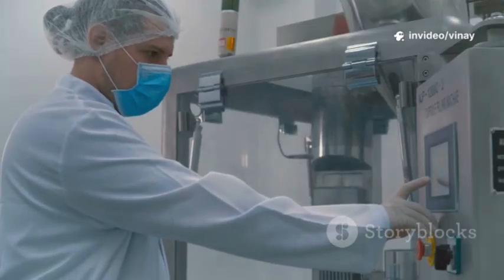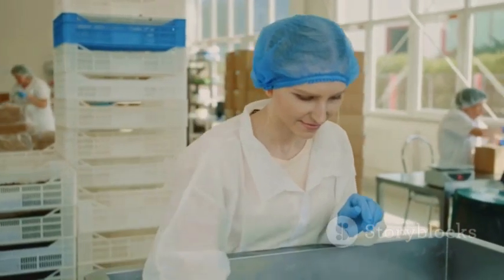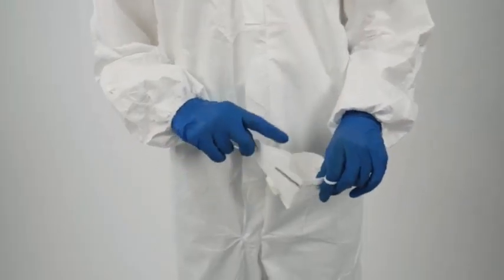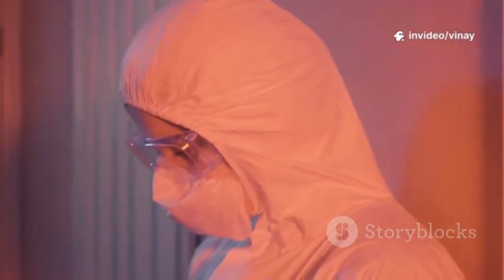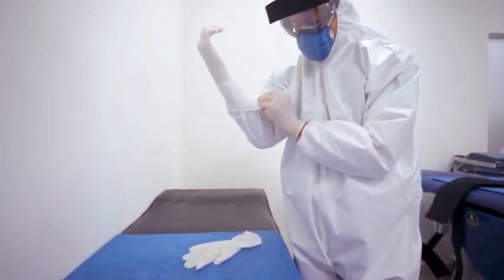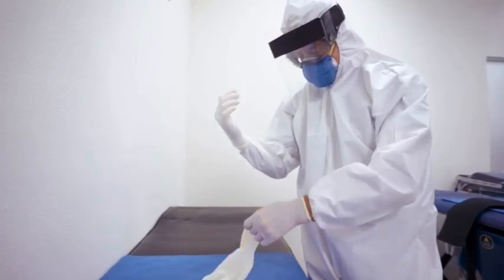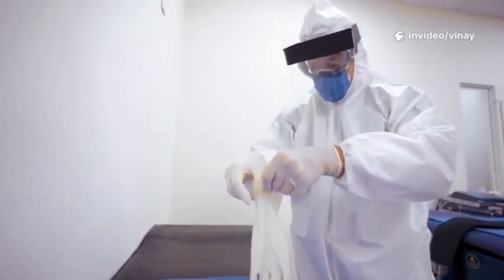The gowning process itself is a precise ritual. It begins with the removal of all street clothes and personal items, followed by donning facility-specific scrubs and shoes. In the next airlock, operators will don a hood, a mask, and initial boot covers. The final gowning step, often occurring just before entry into the Grade B area, involves putting on a sterile one-piece coverall, sterile goggles, a second pair of sterile boot covers, and sterile gloves.